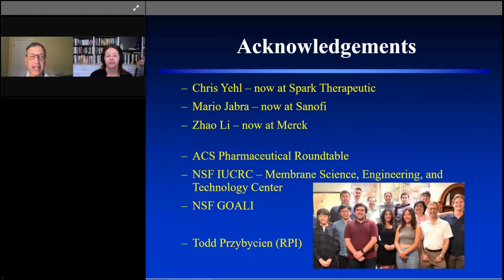That's a great question, and there would be other divalent cations that could be used as an alternative to zinc chloride. There's some literature on the use of calcium that has shown reasonable performance. What we have found is that the best precipitation in our lab has been obtained using the zinc chloride system.